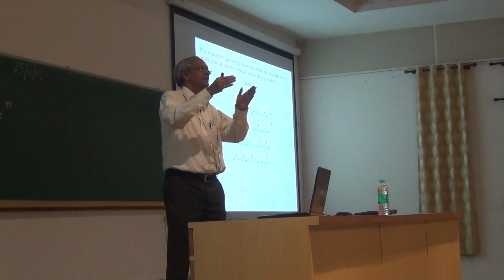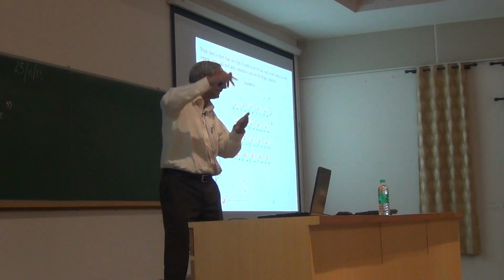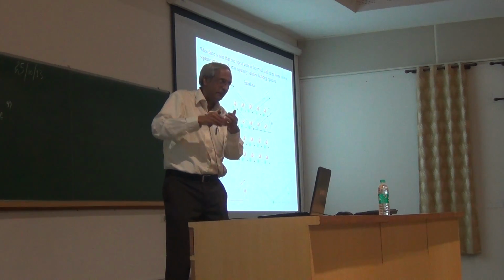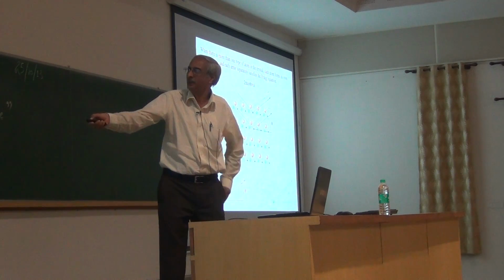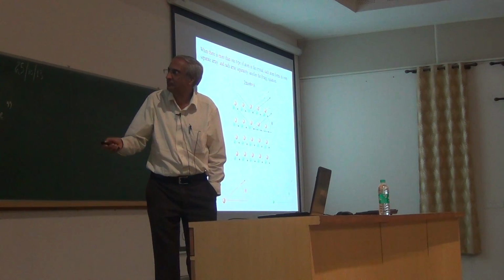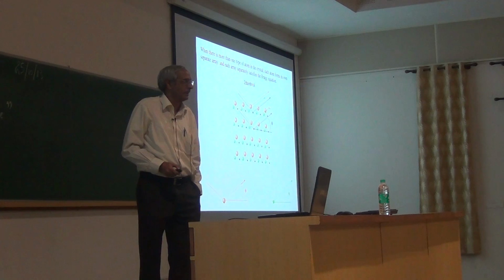So suppose you take the 1, 0, 0 plane, you have d100, you take 1 over d100, and then represent that distance in the form of a point, and that will be the reciprocal lattice point. So effectively it is a clear-cut representation of all these reciprocal lattice points.